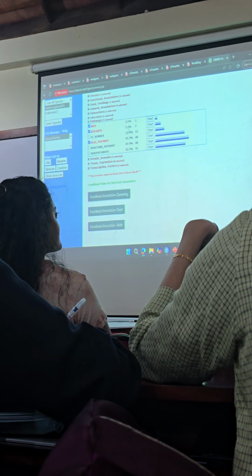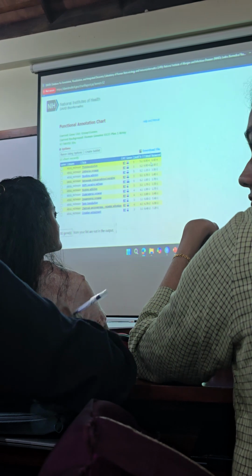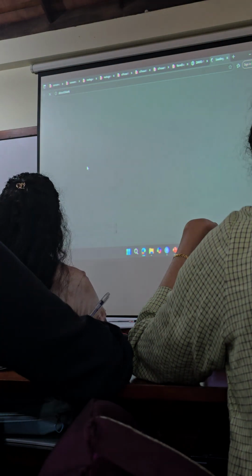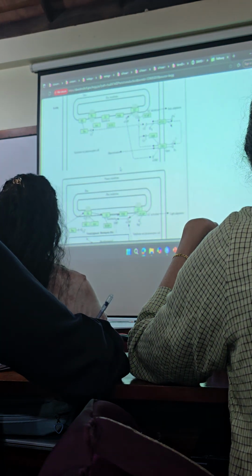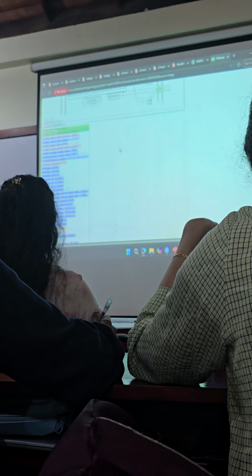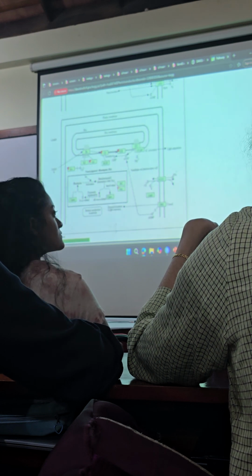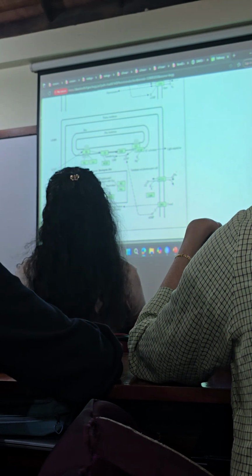Then what you can do is take the pathway. Right? Now you look at the pathway that is most enriched. That's here, right? So you click on that. Now this is the pathway, right? The stars mention the upregulated genes, and if you go down, now these are the genes from your list that belong to that pathway, right? Phototransduction.